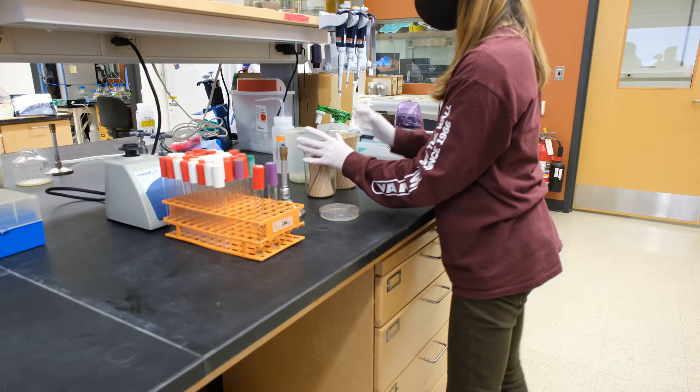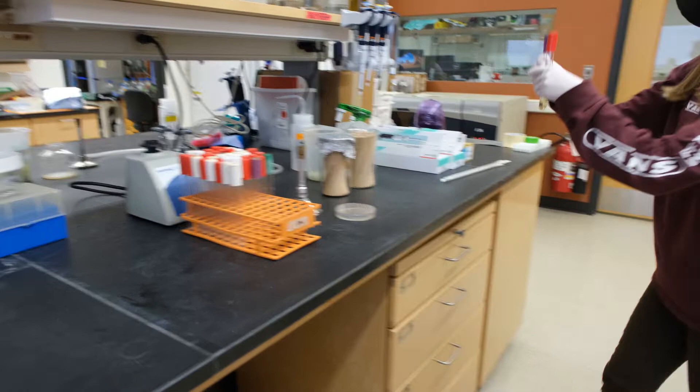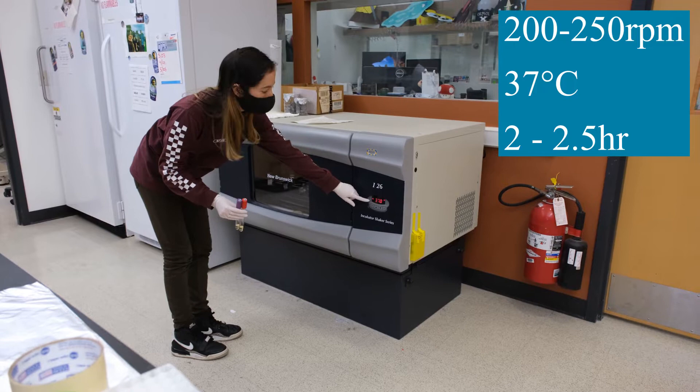You should be able to see colony material blobs floating in the LB and turn off your flame and put your tubes in the shaker at 200 rpm, 37 degrees celsius, and incubate with shaking for two to two and a half hours.